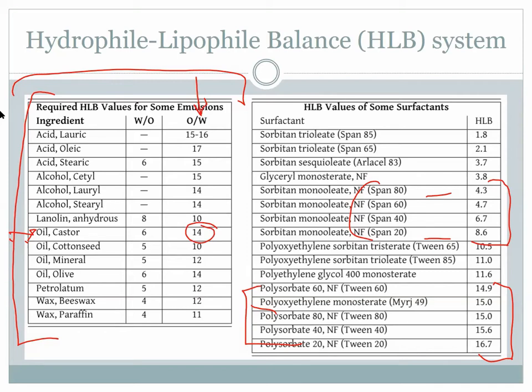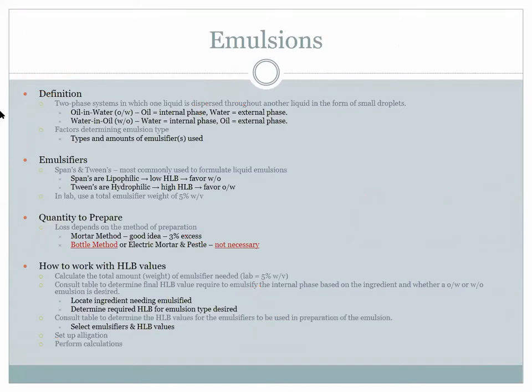So we'll go through and practice this with our actual dry lab. Our numbers will be different for the real dry lab, but this shows you the reasons you need both of these tables. You find the HLB value for your specific emulsifier ingredients, and you need one that's lipid loving and one that's water loving, but there are ranges you could choose within those. Once you have those, you're going to do some calculations to figure out their relative amounts so that you can get the target HLB, which depends on what product you're trying to emulsify and whether you're making a water in oil or an oil in water. That will depend on how we do that. So that's where we're going with the HLB values. This is important to define, and we'll practice here in a minute.